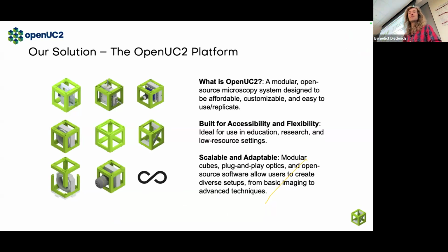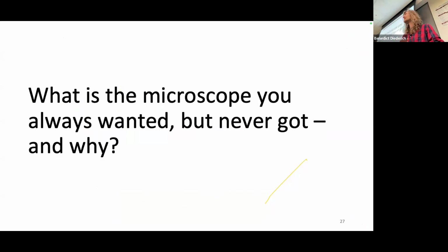Since I should also be a bit curious, I'm assuming some of you have a background in optics. So what is your favorite device that you could never afford, but always wanted to have and that could, for example, be replicated with the cubes? Because this is maybe a challenge for later today: how can we go from this to a producible setup?